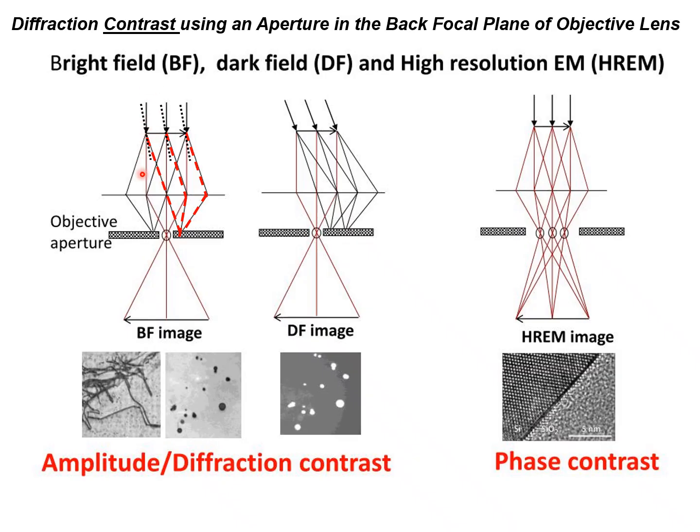So we've got the direct beam coming through, and if the direct beam is focused, we can create an image, focused in the back focal plane of the objective lens, and you therefore select that intensity to create your image. You're basically throwing away anything that's diffracted off at an angle.